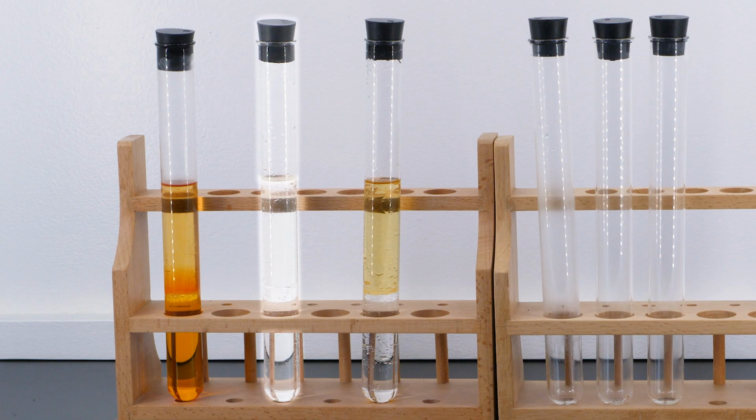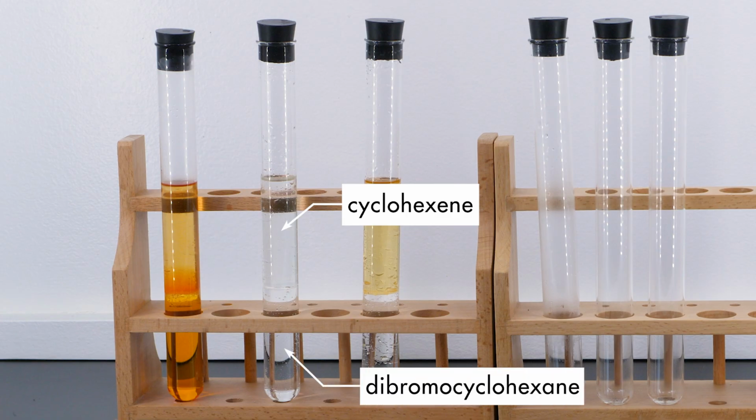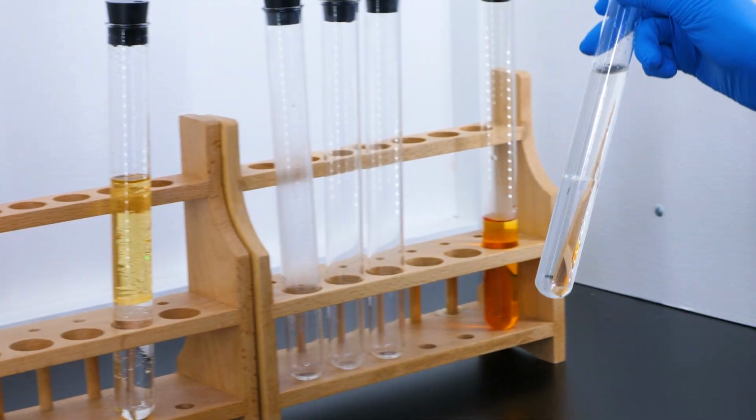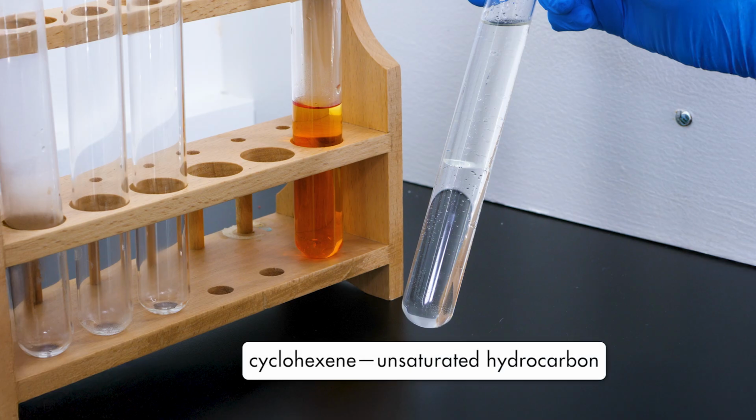Let's look at the tube containing cyclohexene and bromine water. The contents of the test tube separated into two layers. The top layer is cyclohexene. The cyclohexene reacted with bromine water to form a colorless compound called dibromocyclohexane, which settled to the bottom of the test tube because it is denser than cyclohexene. When we hold the test tube near the test tube of bromine water, we see that both layers are colorless. Since a reaction occurred, we conclude that cyclohexene is an unsaturated hydrocarbon.